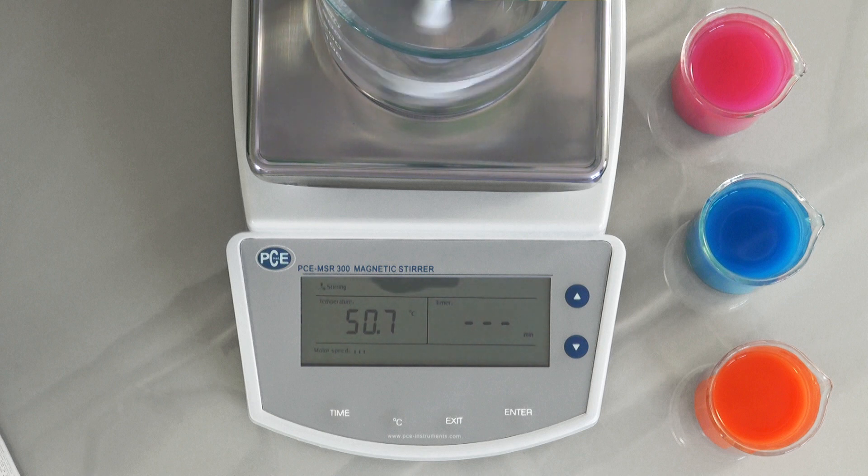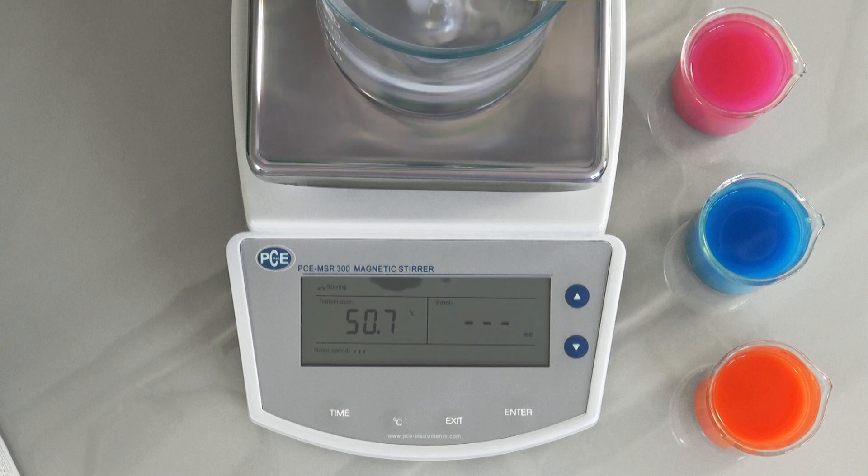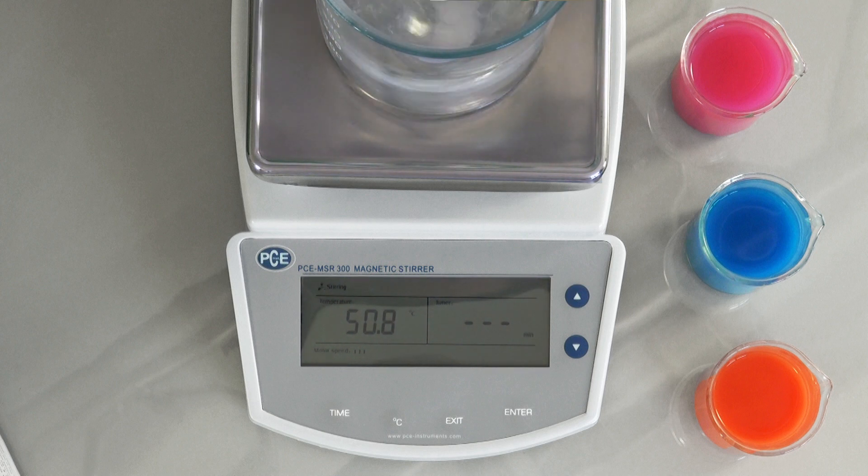In the bottom part of the display you can see the bar which shows the set stirring speed. In the top left display area I can see a revolution sign which shows the function of the rotation. By pressing the rotation keys longer, it skips to four-times jumps.